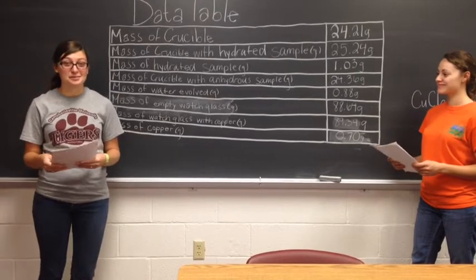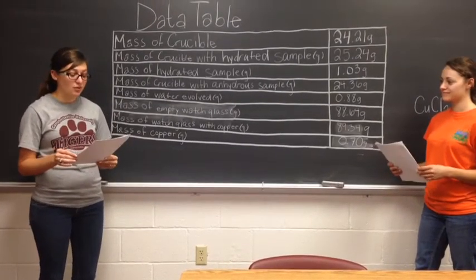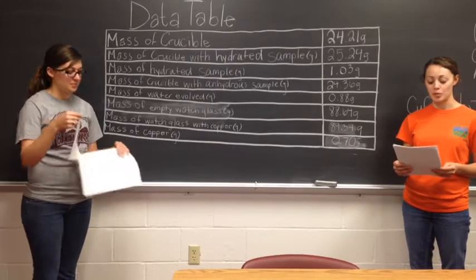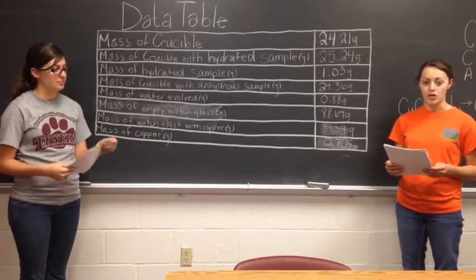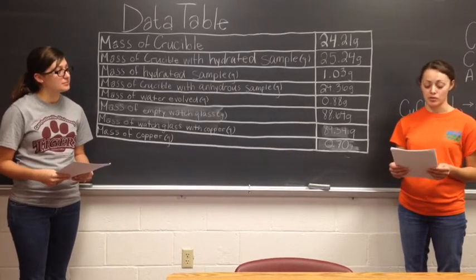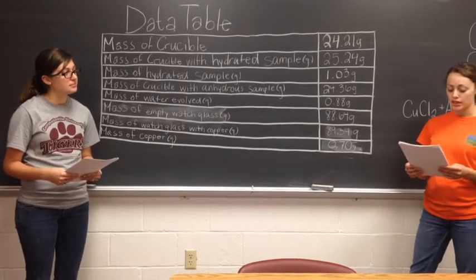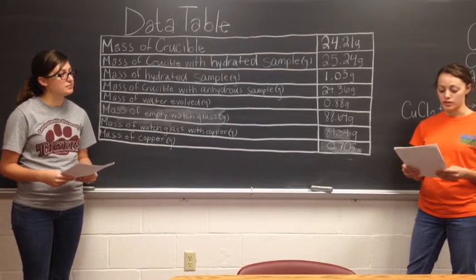The purpose of this experiment is to learn how to determine the amount of H2O in a sample, also to be able to determine the mass and moles of the sample. The law of definite proportions states that mole ratios in a compound will be small whole numbers. The law of multiple proportions states that there may be more than one plausible mole ratio for the components with those elements. Determining the mass of the elements in the compound will allow the true chemical formula to be established.